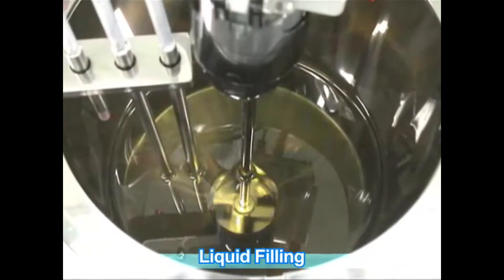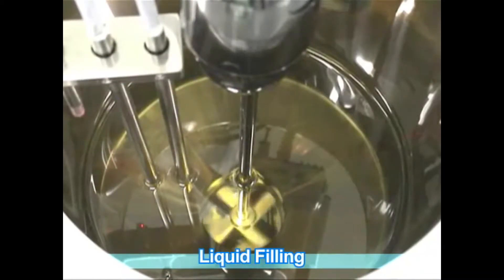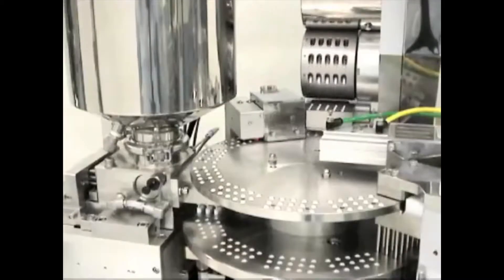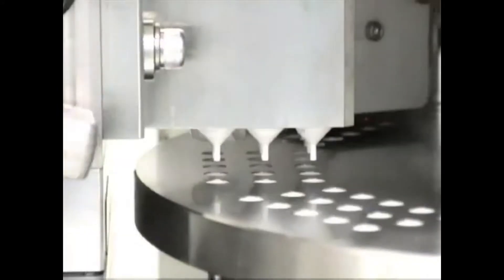Warm purified water is circulated to control the temperature inside the hopper. A stirrer is built in to keep the consistency of the liquid uniform. Capsules are filled with liquid dispensed by piston pump from the hopper.